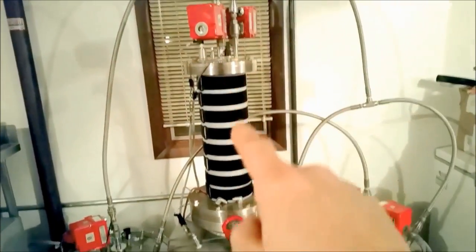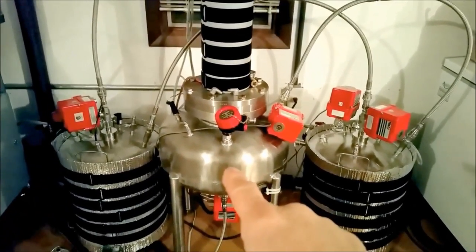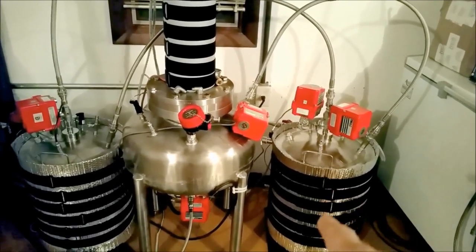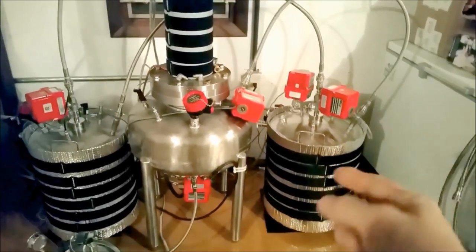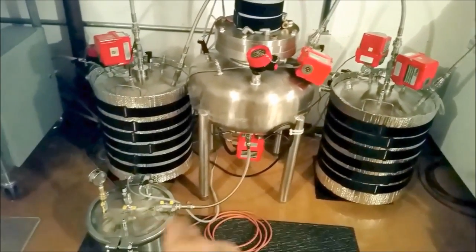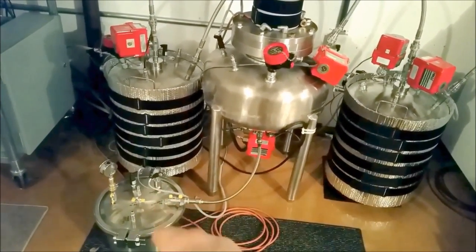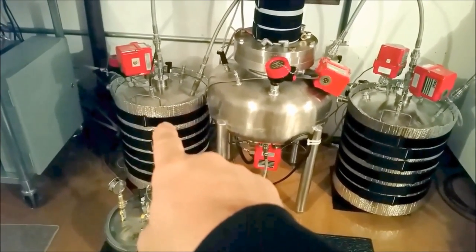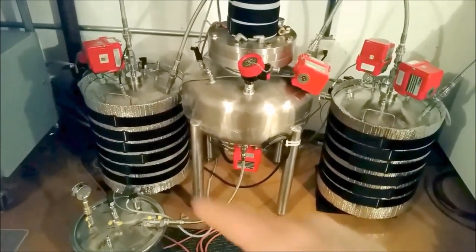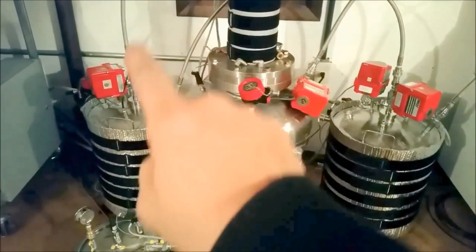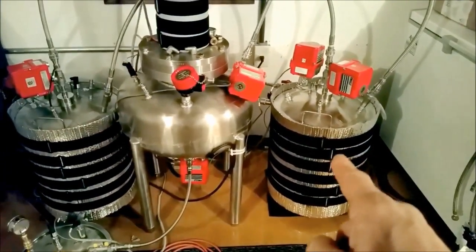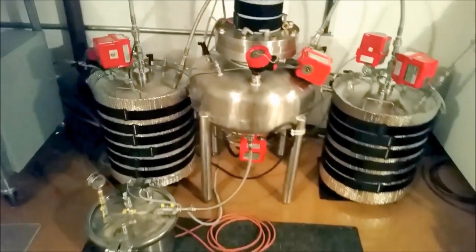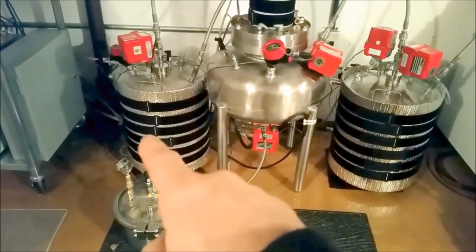The way it's hooked up, the solvent flows into here, goes through the column into the extractor tank, and then it recovers into this tank so that this tank can be standby cold, ready to go. Costs a little more money, you have a second tank. Then the same process happens—it recovers into this tank, drains into this tank, and then the final bit recovers into this tank or this tank. Because while this one's getting cold, this one can be getting cold. It takes an hour or two to recover the solvent. When this one's cold, then we turn the heater on to this tank and it transfers all the solvent back through that line into this line and back into the tank where it started from.